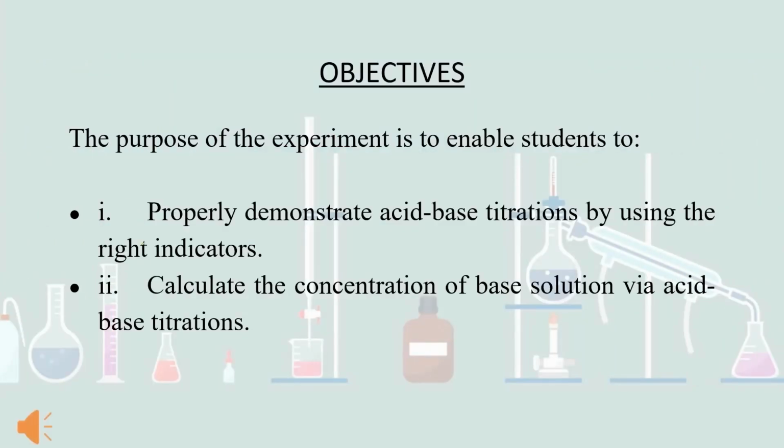Objective for this experiment. The purpose of the experiment is to enable students to properly demonstrate acid-base titration by using the right indicators and to calculate the concentration of base solution via acid-base titration.